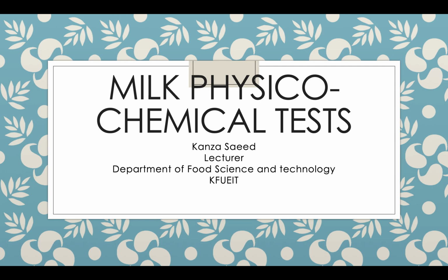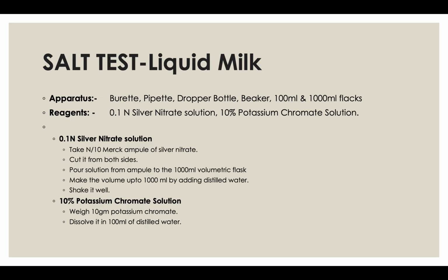Bismillahirrahmanirrahim. Assalamu alaikum. In this lecture, we will discuss physicochemical tests of milk. First of all, we'll discuss the procedure of salt test.